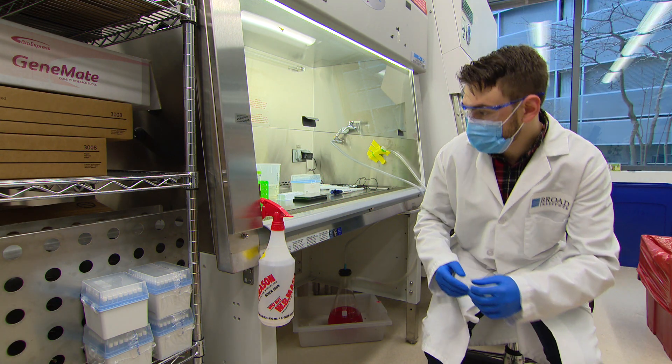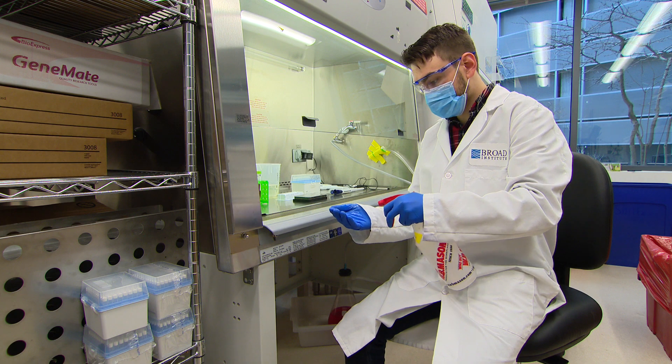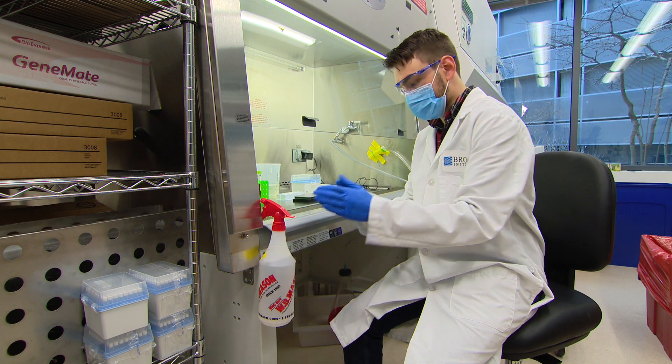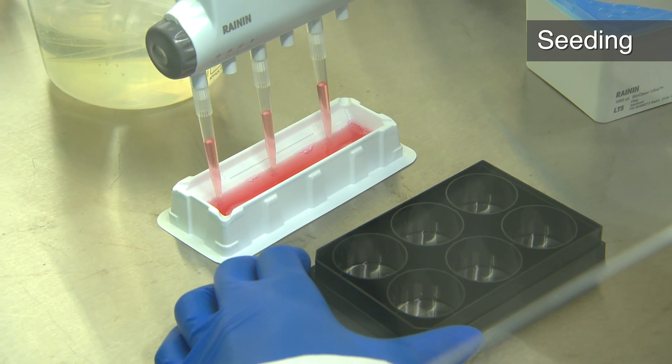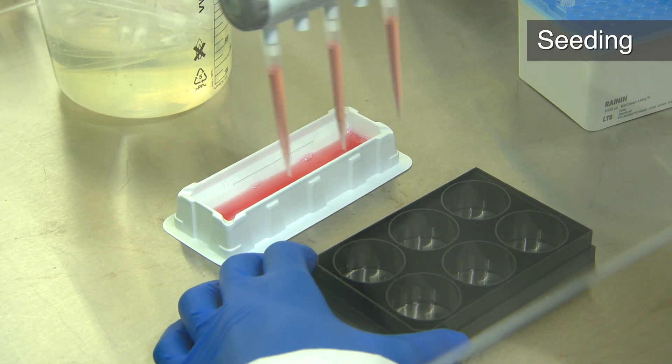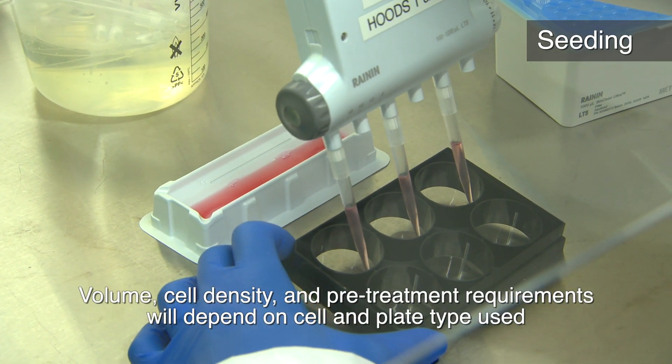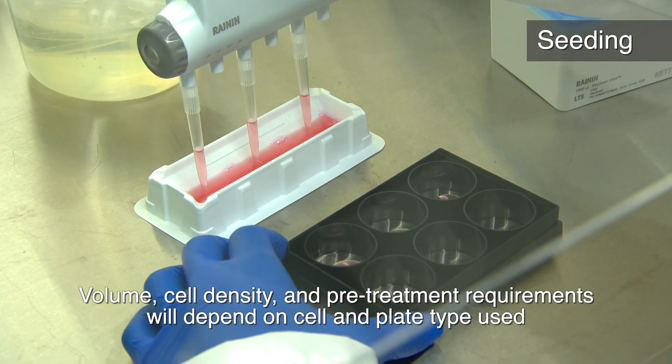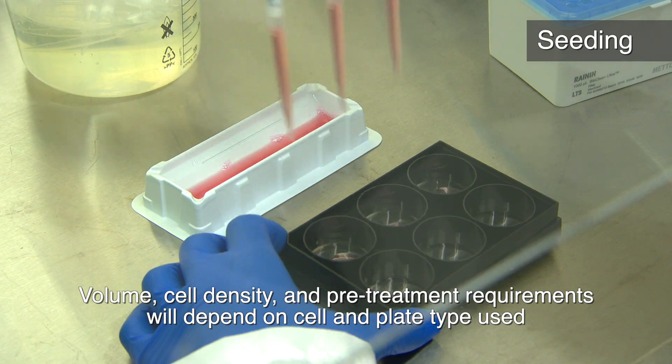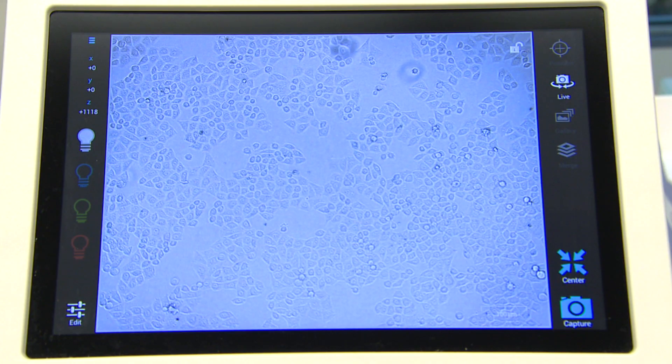Now, we will demonstrate the optical pooled screening workflow using a P65 localization assay in a 6-well plate of HeLa cells. First, seed 400,000 cells per well in 2 milliliters of media and incubate at 37C to yield approximately 80-90% confluency 48 hours later. This brightfield image shows how the cells should look when ready.